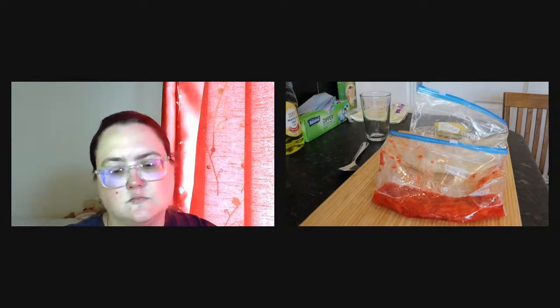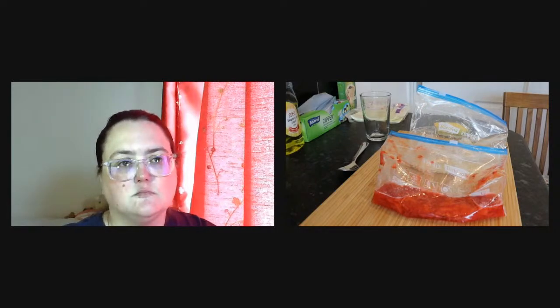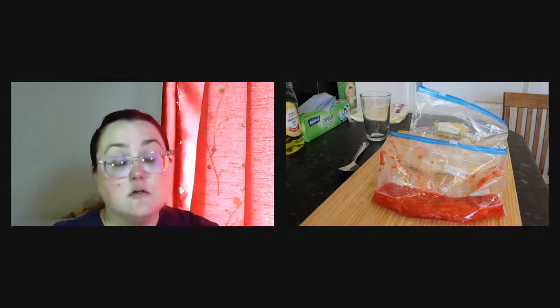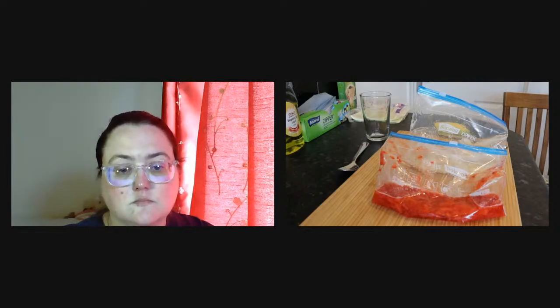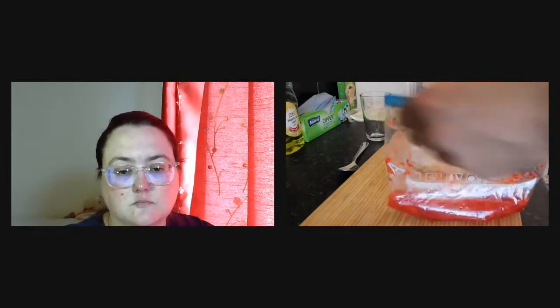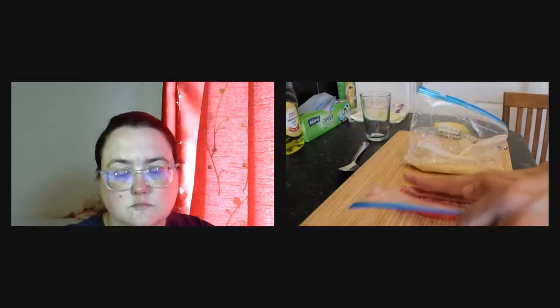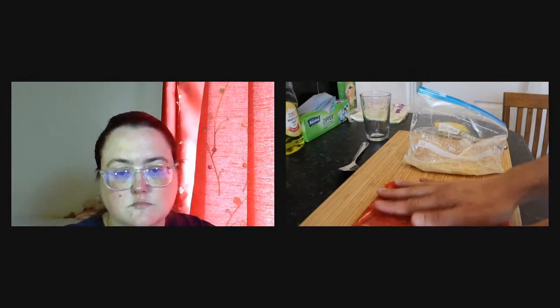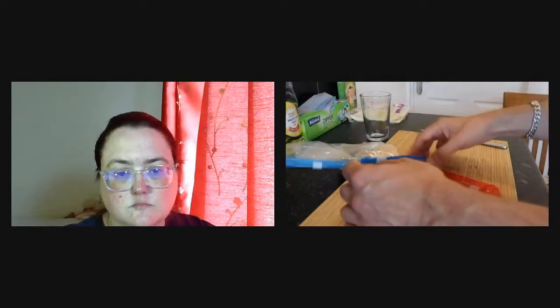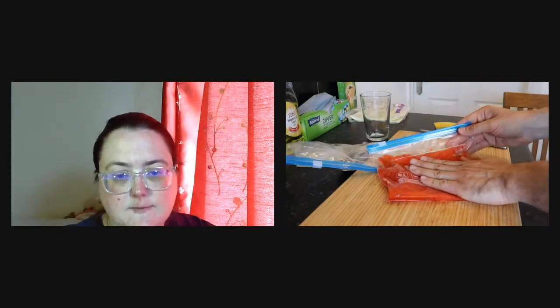We use the salt because the DNA interacts with the salt and will untangle itself. So it will become easier for us to extract it and see it. That's why we use some warm salt water that we add to our bag, and when we have that added, we need to mix. So again, I have one corner of the bag which is open, making sure that you can see everything. And I'm going to mix.